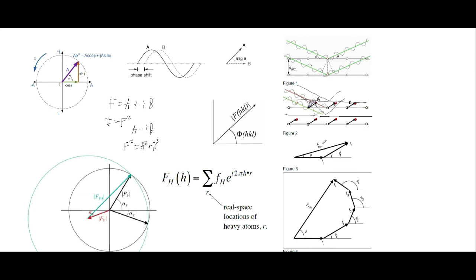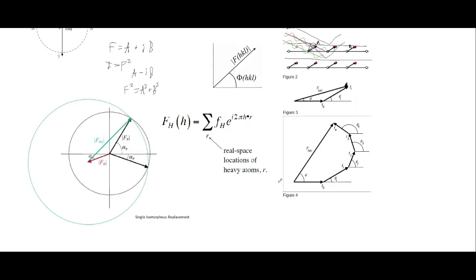And so we will only see this structure factor here. So we will see this intensity here, but we don't know what these different phases are from the two different planes that we were reflecting on up here. And you can have multiple different planes, this shows, with all their different phase angles.